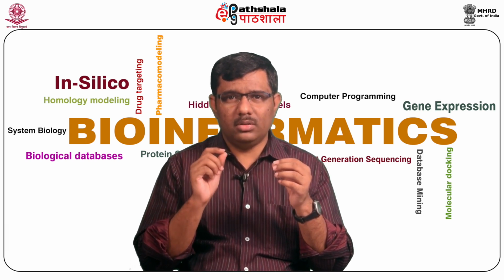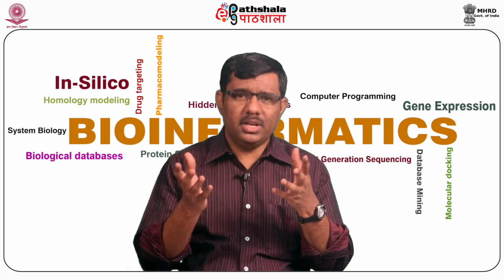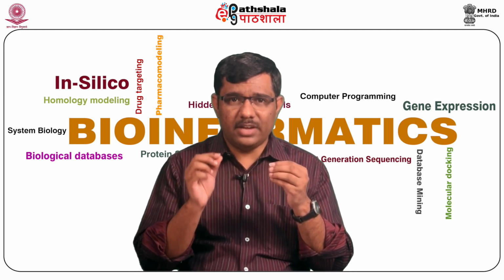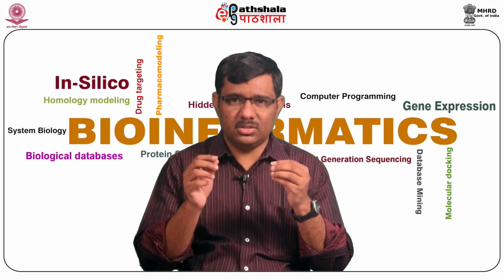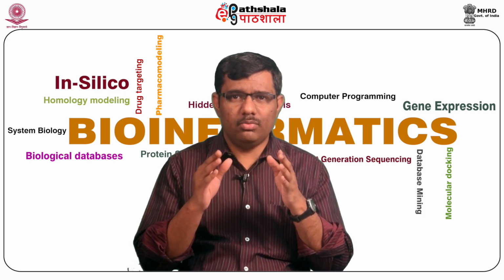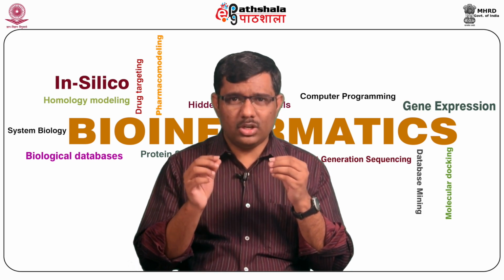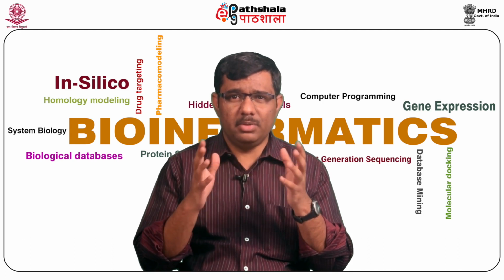To define a rotamer, the dihedral angle for a particular residue can vary from 0 degrees to 360 degrees. However, certain angles are energetically favorable, and these are called gauche plus, that is plus 60 degrees, gauche minus, which is minus 60 degrees, or trans, which is 180 degrees. So the average value from a finite number of possible dihedral angles gives the favorable conformers or rotamers. These rotamers are, in a sense, a discretization of the dihedral angle space of amino acids.